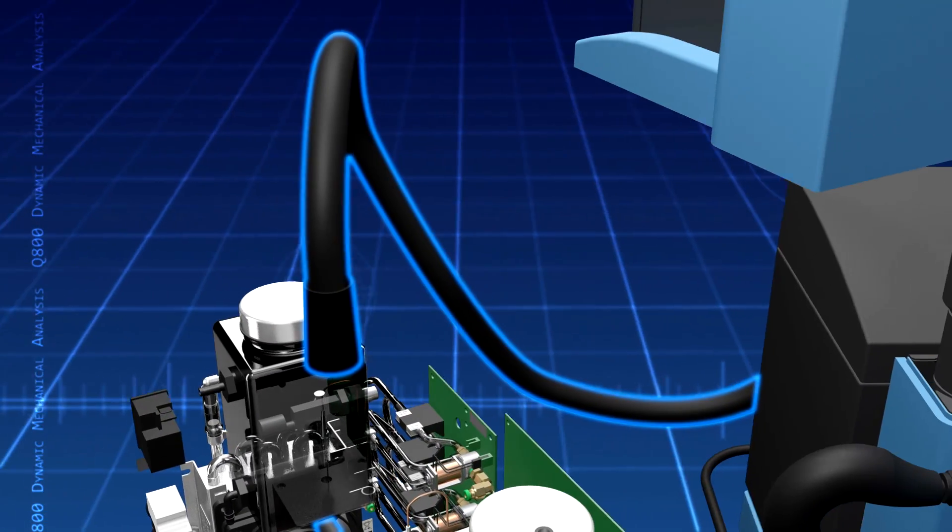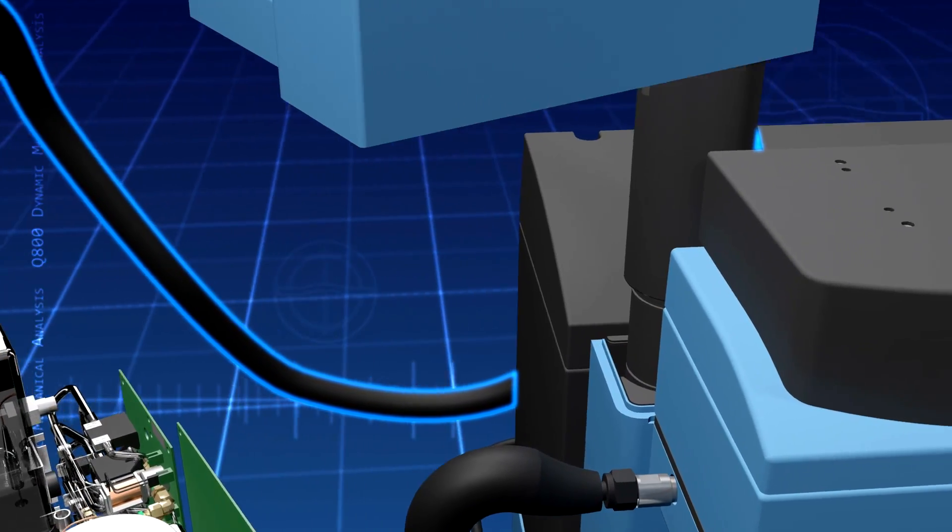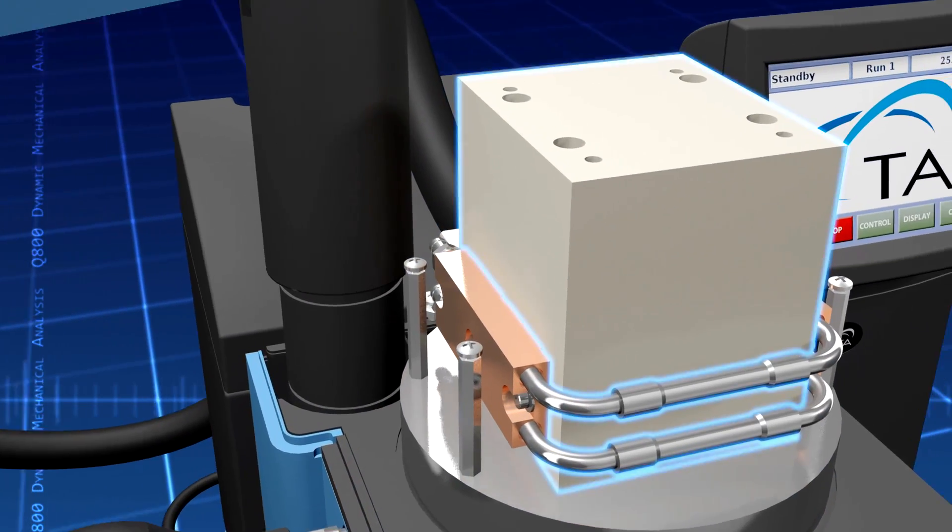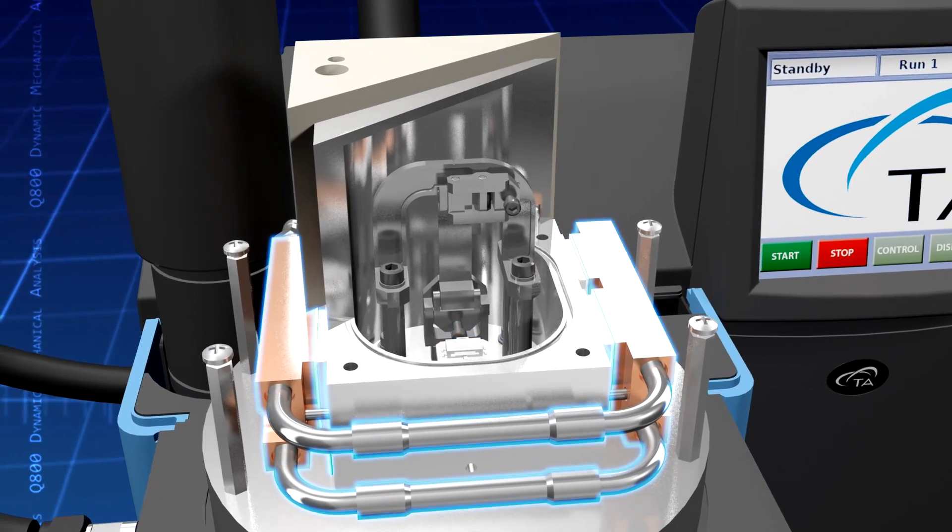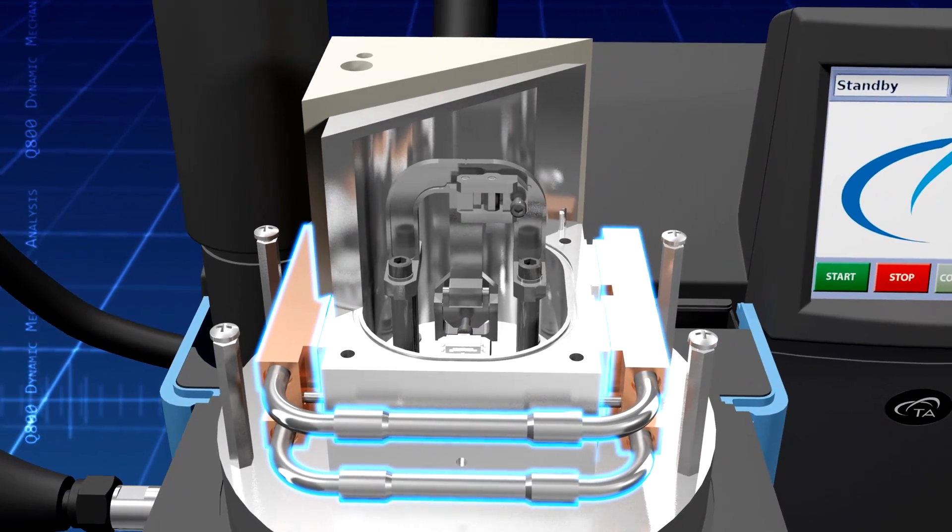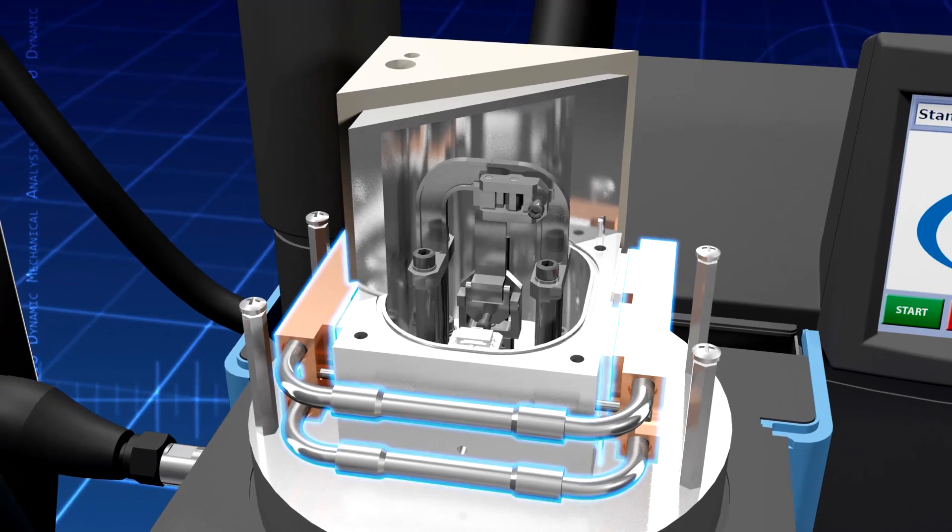A thermostatically controlled transfer line delivers the humidified gas to the high-performance environmental chamber. The DMA-RH accessory includes Peltier elements, which precisely control the chamber temperature.